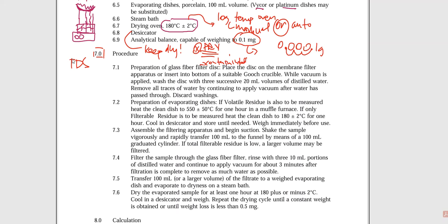Now, this 20 milliliters does not have to be exact. This is just an estimate. And if I can use a graduated cylinder to measure those out, that is great. I mean, nothing else really needs to be done. I don't need to be volumetrically pipetting this. That is too accurate for what we need. But a graduated cylinder will do a pretty good job for us.